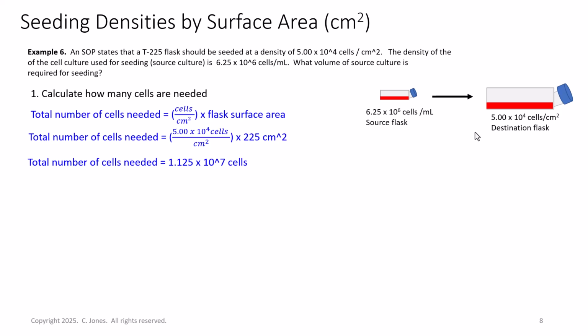And again, you notice here, and some of this I'm doing deliberately, or at least pretending that I did it deliberately, that I have too many significant figures, right? We really only want to go 2 places past the decimal, but I could justify that by saying we don't round off until we've completed the entire calculation. So maybe I could get away with that.